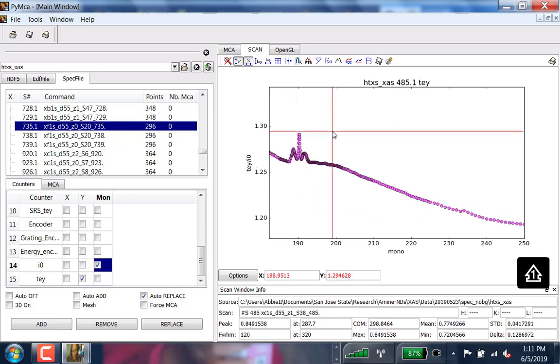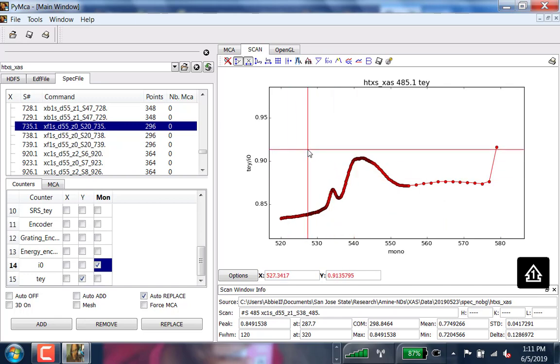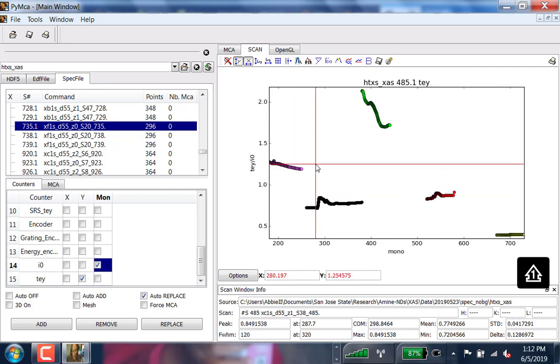And Daniel, to your point, if we keep zooming out, this is our oxygen-related peaks, which should be related only to the bonding environments around oxygen. That's the beauty of these techniques, they're element specific. Boron is individually probed, fluorine is individually probed, carbon is individually probed. Typically, the feature right here should be some sort of C double bond O related feature. How do you unzoom, sorry? Right click. You keep right clicking and you zoom out till you get to the original.